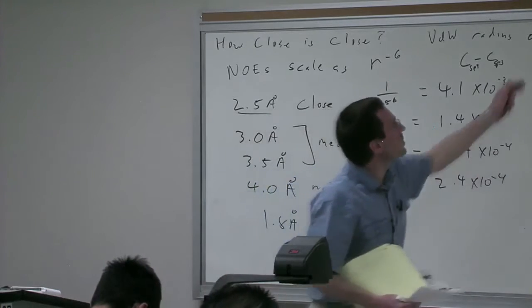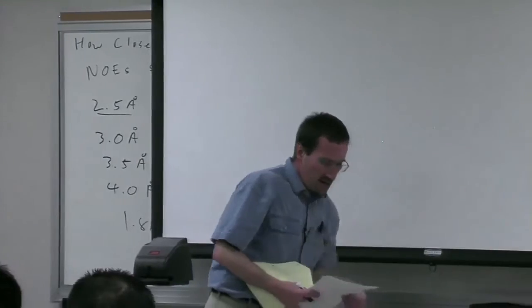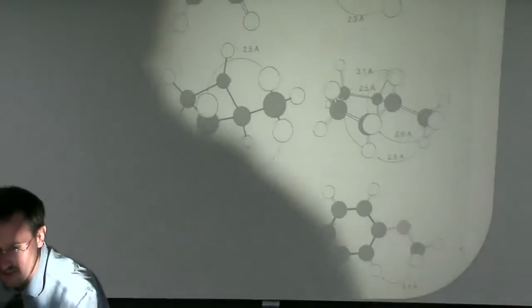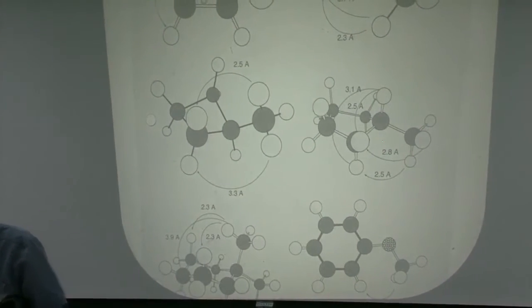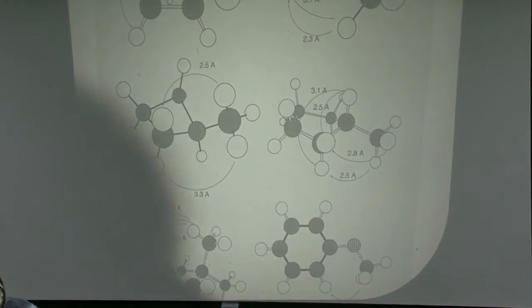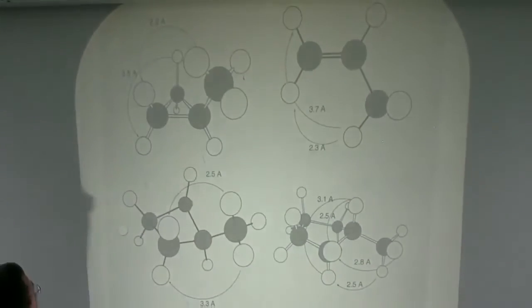Okay, what's close? What's far? I made up these models. I didn't have Pymol at the time. I don't even think it had been invented, but it's the same basic thing. It's some molecular mechanics calculations. Okay, so I just took a few systems that I use to calibrate my own thinking.